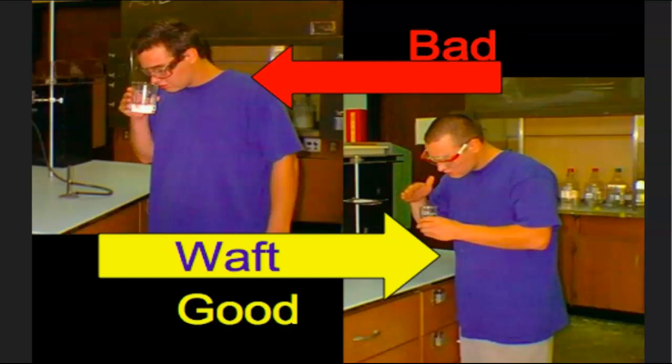All right, so here's back to our wafting. Wafting, hold it out away from your body, give it a little fanning motion, and take a little sniff. Don't stick your nose right over the substance and take a big inhalation, because otherwise that chemical could potentially burn your nose and your lungs and cause you permanent lung damage. You have to be careful when you inhale substances.